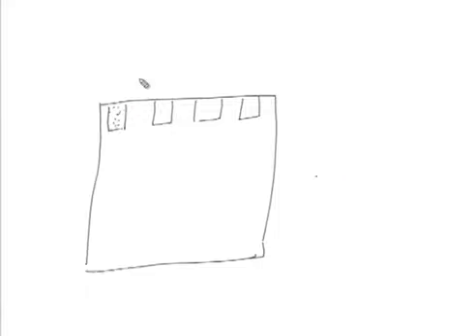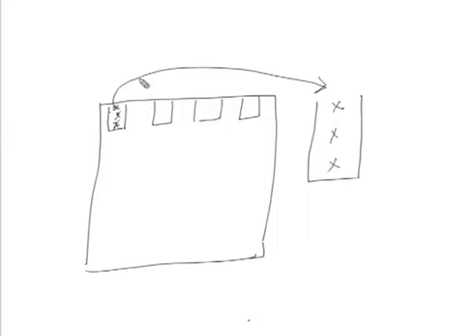Now, if I just show you this here: if I have a sample at this place and this place and this place, let me show it here. Say this is your well where we are loading the sample. Now, you have a sample here, here, and here, and this is the boundary, or the interface, from where the sample is going to enter the gel.